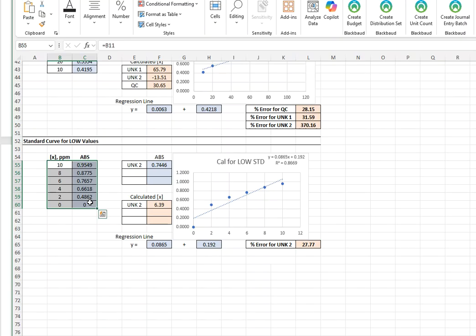Again, your data might look like the 3 graphs that you see on the screen, and that's because we are relying that this person did it the proper way, and maybe they didn't. But there's the graph for 10 and lower. So again, it's all about linearity. How close of a line is it going to be? And then how is it going to affect my concentrations when I begin to solve them in samples and unknowns?